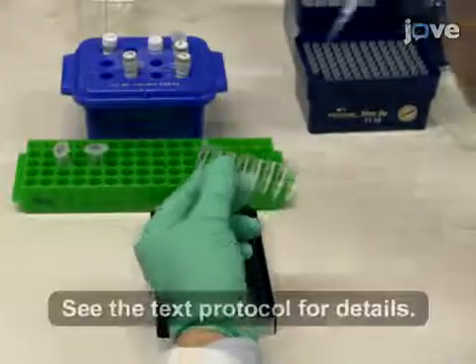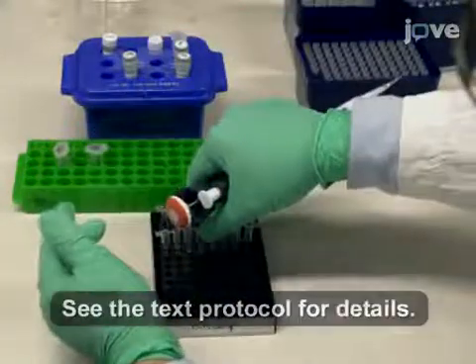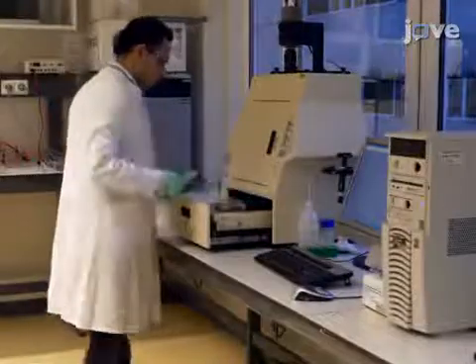If they aren't there, use a microliter of products as a template for another PCR. The new products should be in the appropriate range. Then, proceed with cloning the best products.